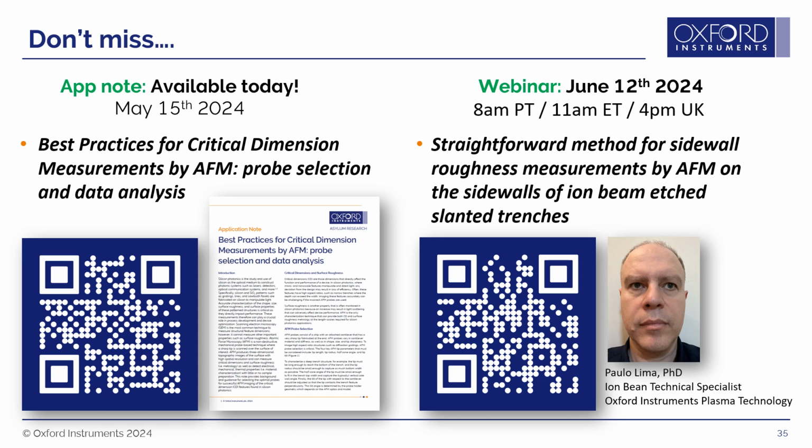First question: is it difficult to use high aspect ratio AFM probes? High aspect ratio probes are, handling-wise, very similar to a normal probe in terms of picking them up with tweezers. Of course, a little bit of care needs to be taken when choosing the settings, but in general, it's not that much different from using regular probes.